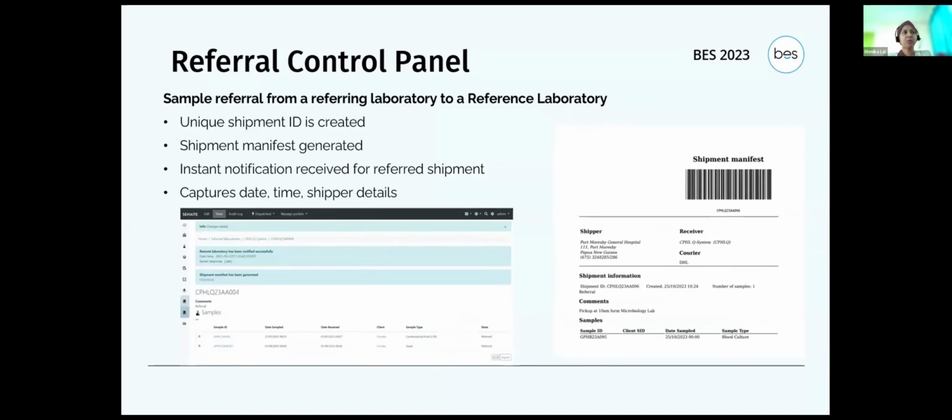This shipment manifest will contain all the necessary information related to the shipment and the samples, as shown in the picture on the right. It also instantly notifies when the samples are received on the other side at the reference laboratory, and it also captures date, time, shipper details, etc., on the SENAITE system and also on the shipment manifest.